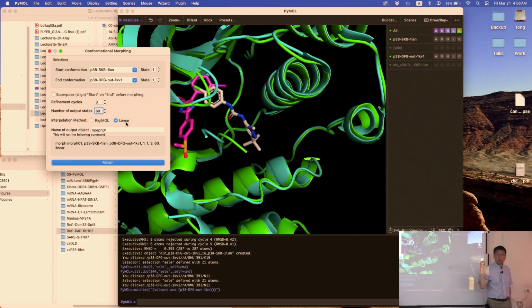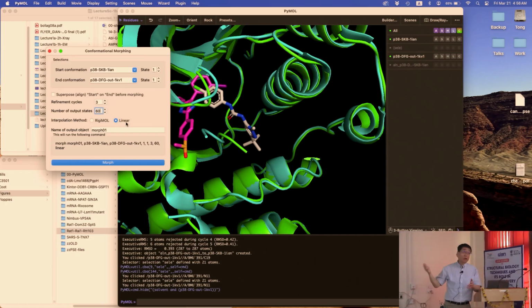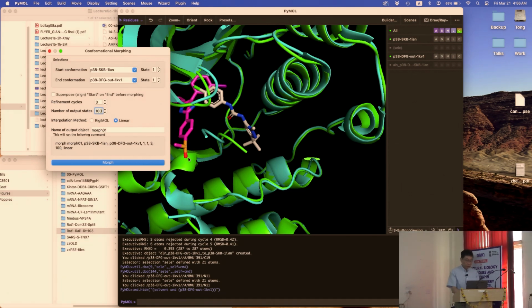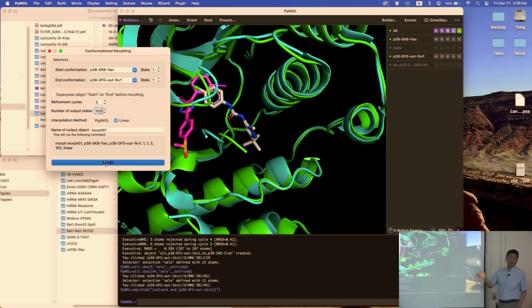So you see what the input, you had similar things. You can go to 100 if you want. I mean, this is actually very fast, so calculation is very fast. Let's do 100. So the movie is slower, so it's easier for you to see. Okay, got it? All right, when you're ready, just say morph. And then you need to do calculations. You need to make a movie 100 frames.